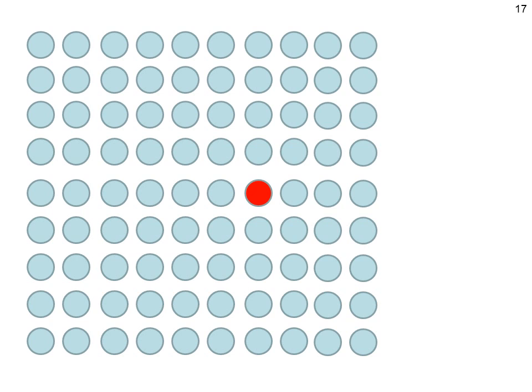Now, with mass spectrometry or most other analytical techniques, we're not looking at single molecules, but we're looking at an ensemble of many, many molecules. So that means, averaging out, we will find 1.1% of all carbons in molecules being carbon-13. The blue spots are carbon-12, and the red one is the one carbon-13 atom in this molecule. And these are the natural abundances again, 98.9% for C12 and 1.1% for 13C.